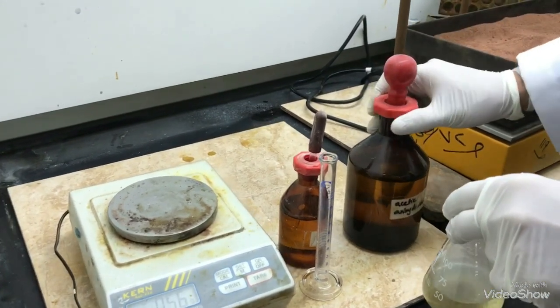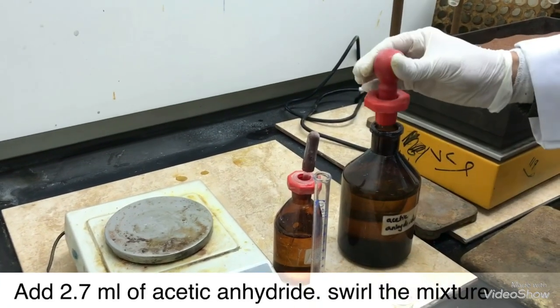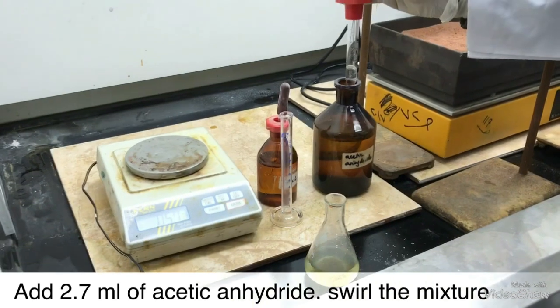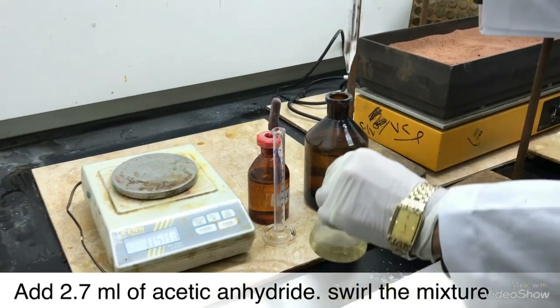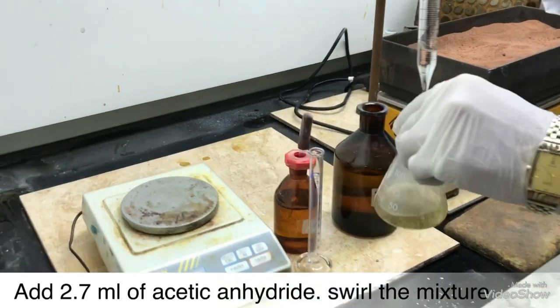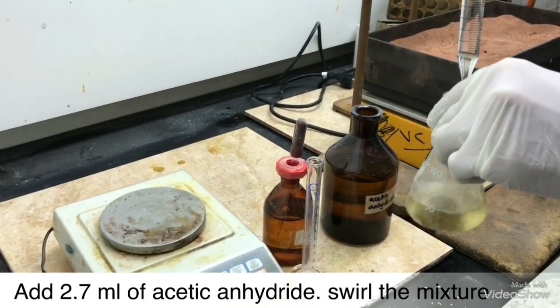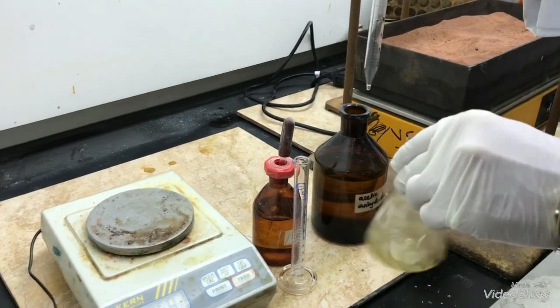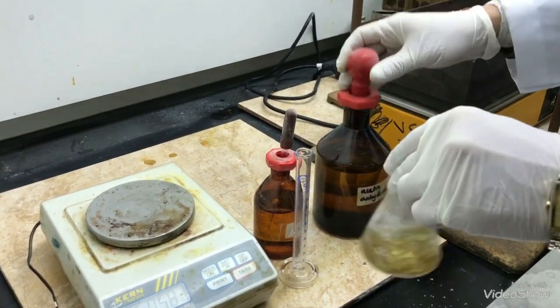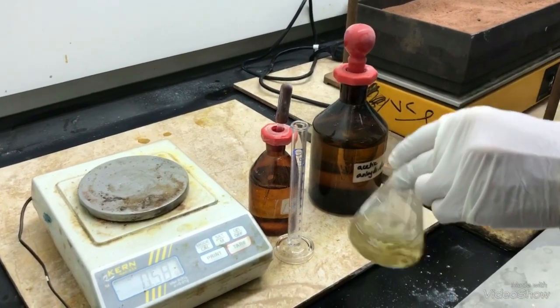Now we will start adding the acetic anhydride. Now add 2.7 ml of acetic anhydride. Swirl the contents to dissolve the anhydride.